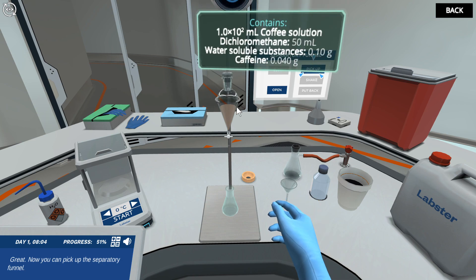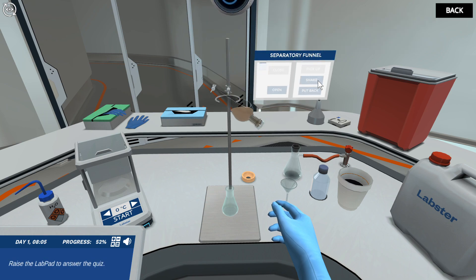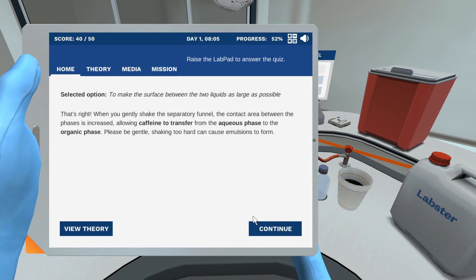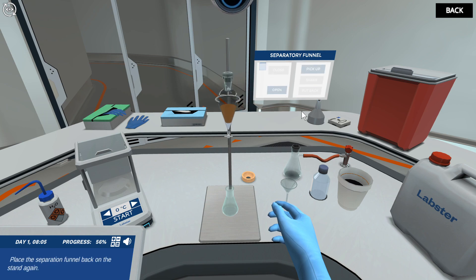Now you can pick up the separatory funnel. Why do we shake the separatory funnel? That's right! When you shake the separatory funnel, remember to vent by opening the stopcock, then close the stopcock and place the separation funnel back on the stand.